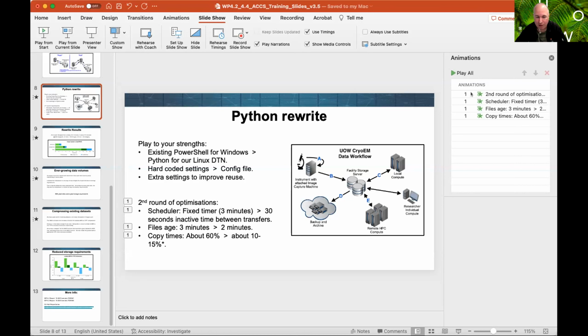If we have to restart something, or the network drops out for a short while, less than the 22 hours or whatever it takes for those hard drives to fill up, that process will keep running. We can get the network fixed, we can reboot our machine, do whatever we need to, and then that script will kick off and resume doing the transfer. So that makes sense. Yeah, that would save a little bit of time, and it would be lovely to do, but it's not something we can do at the moment, or at least it's not supported at the moment.